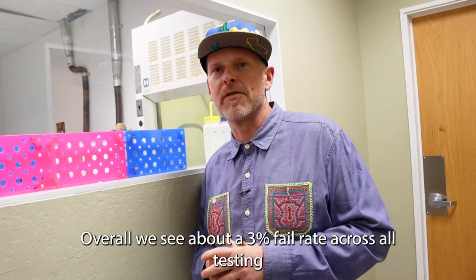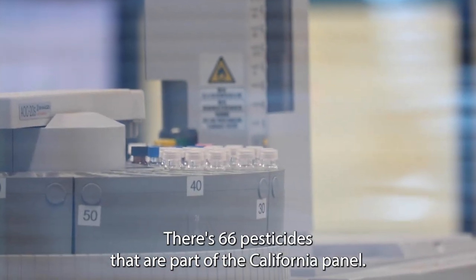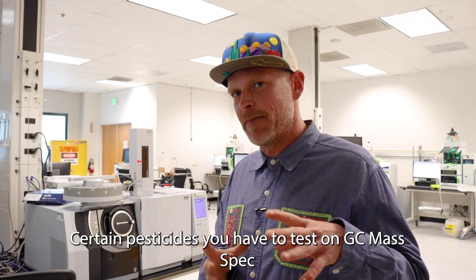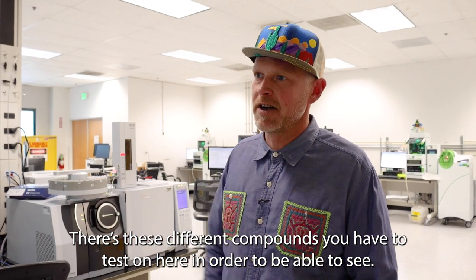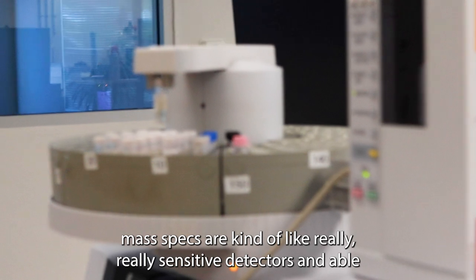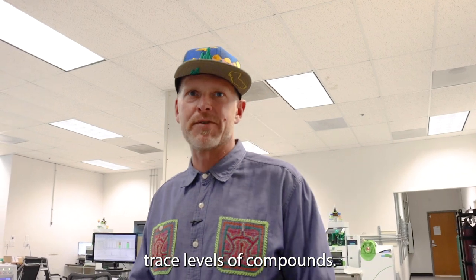Overall we see about a three percent fail rate across all testing. This is our mass spectrometry lab, where a lot of contaminant testing is done. There are 66 pesticides that are part of the California panel. Certain pesticides you have to test on GC mass spec, others on LC mass spec — different compounds require different instruments to cover the full range. Mass specs are really sensitive detectors, able to detect very trace levels of compounds.